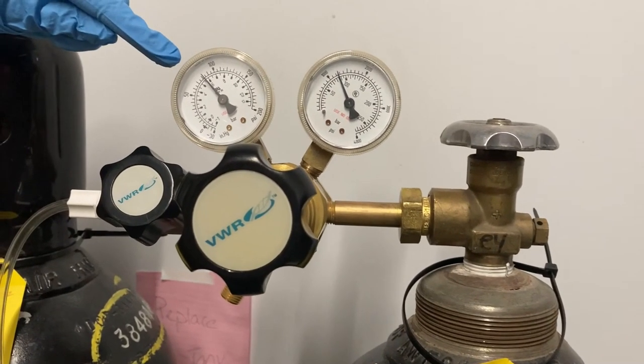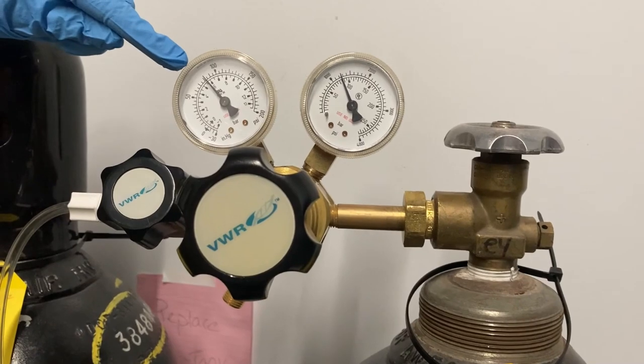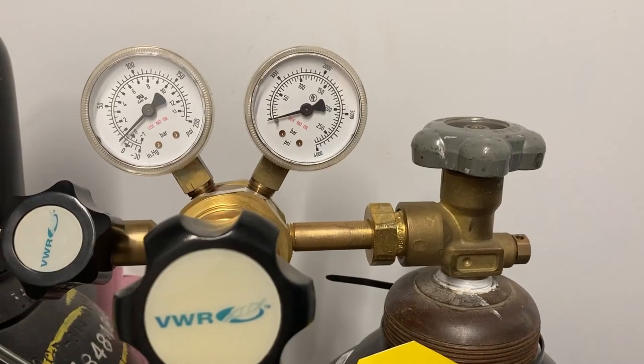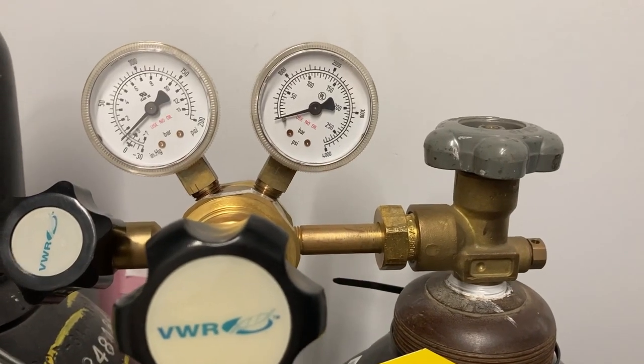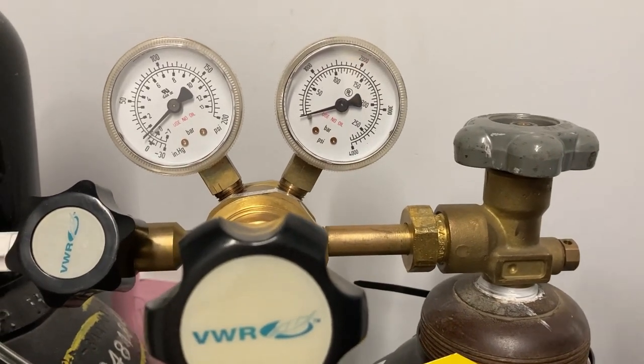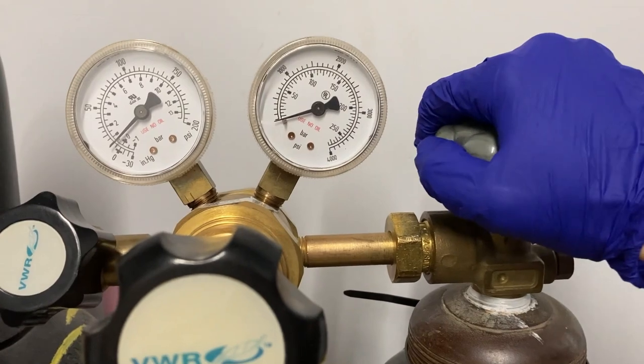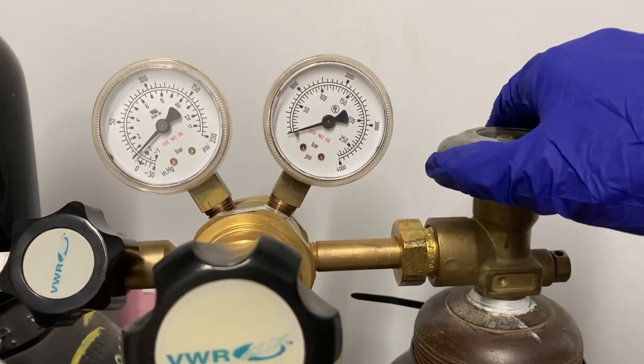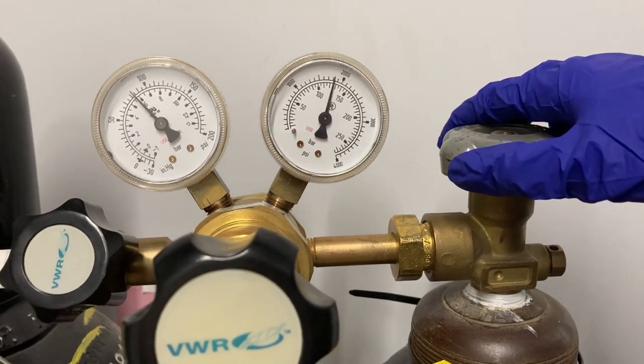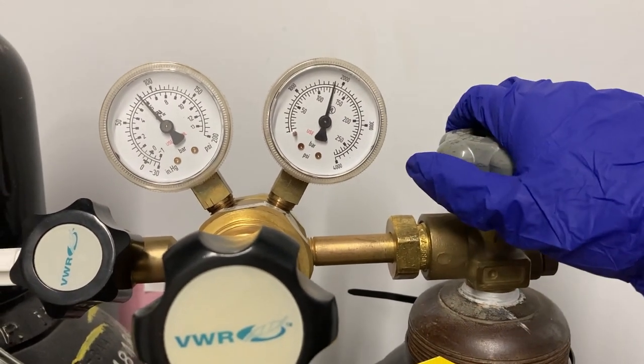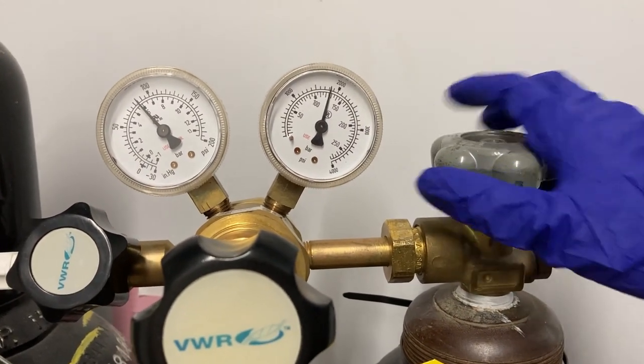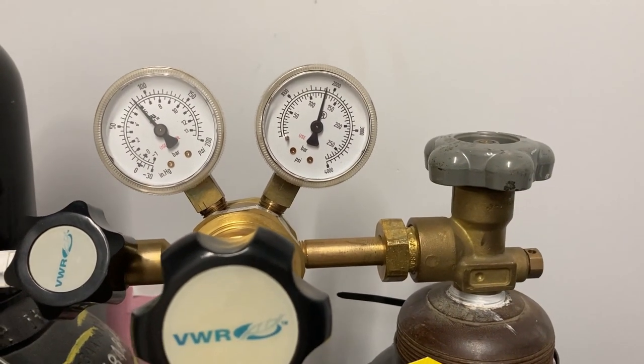If both gauges are at zero, this can mean that the tank is closed and there is no nitrogen leaving the tank. The tank can be opened by turning the main cylinder valve on the top of the tank. If the gauges remain at zero even after the tank is open, then the tank is empty and needs to be replaced.